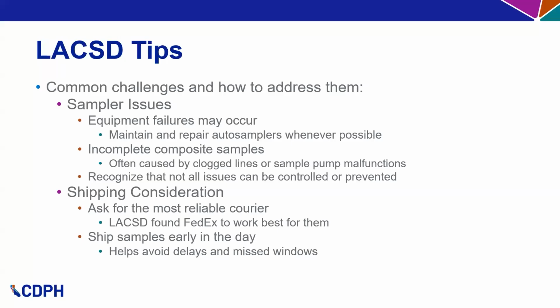And so LACSD found they were originally on GLS and we switched them over to FedEx and they found that it worked a lot better for them because they were able to avoid issues of pickups. And it just seemed that FedEx had better coverage of their area compared to GLS. So that was a really big thing that they have advised, just finding a reliable courier and partner for them. And we can always help with that as well. They are not the only utility that has had similar issues of shipping where we've had to switch them onto different couriers just to find the best option.